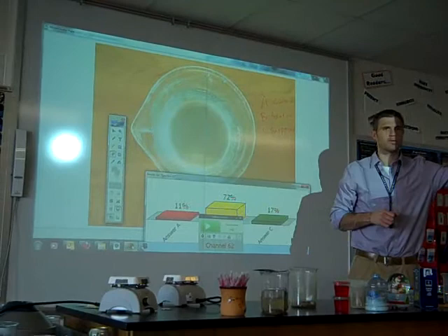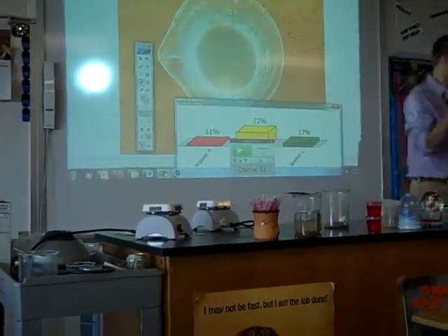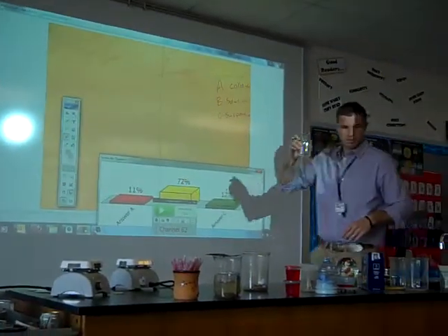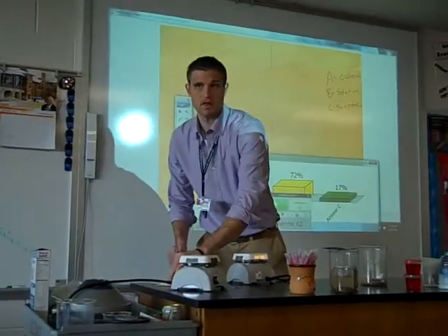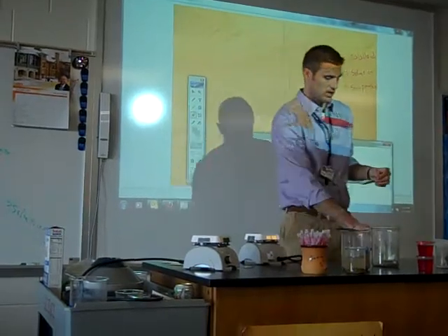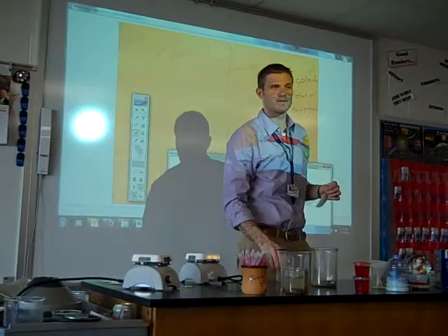Someone else, help us out here. Filter. Does it filter? Okay, wonderful. Let's try it. Does it look like 2 different substances, you guys think? No. It does not look like two different substances. What else? Anyone else? Does it settle? If I look at this, is the salt settling? No, it's dissolved. I can't even see it anymore.